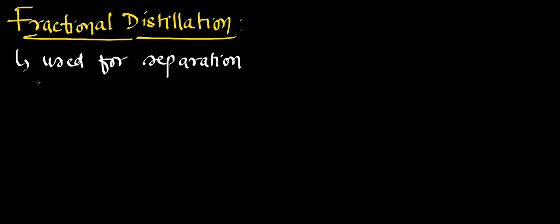Now we will discuss fractional distillation. This method is also used for separating miscible liquids. Like simple distillation, fractional distillation is used for separation of miscible liquids. What are miscible liquids? The liquids which mix uniformly with each other.